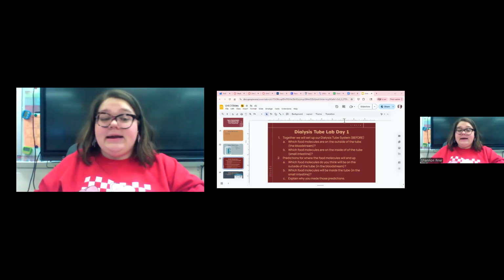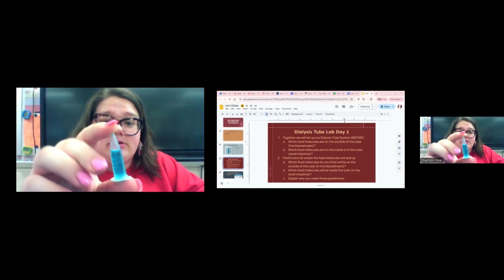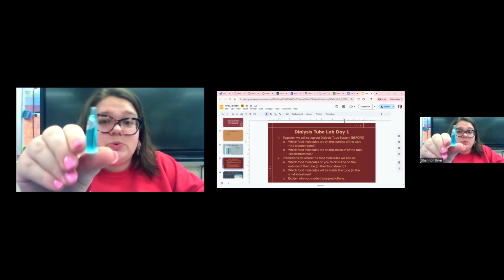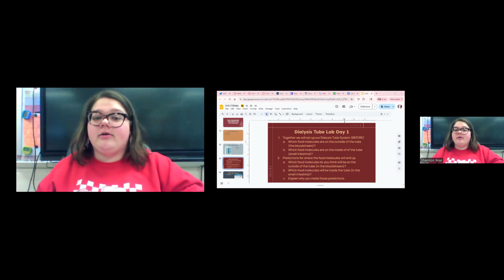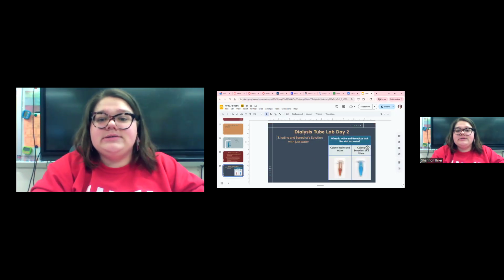Okay, Benedict's is going to tell us if there is glucose present, so sugar, tinier sugar molecules. And this is the color of Benedict's just with water. So write down the color that is in part two. You can see the picture here. Color of iodine in water, color of Benedict's in water.